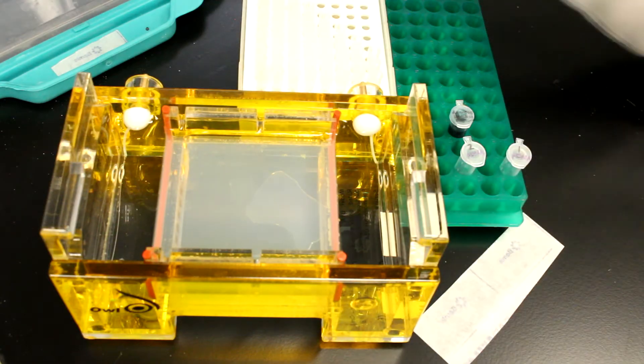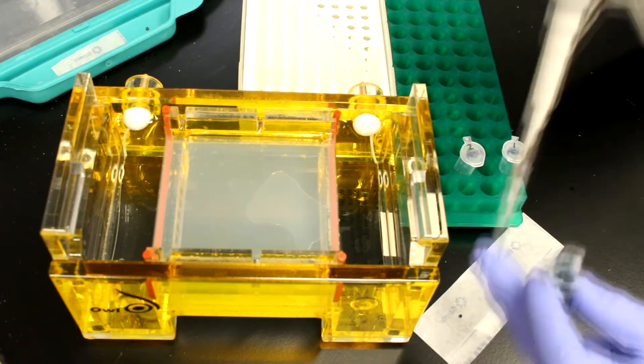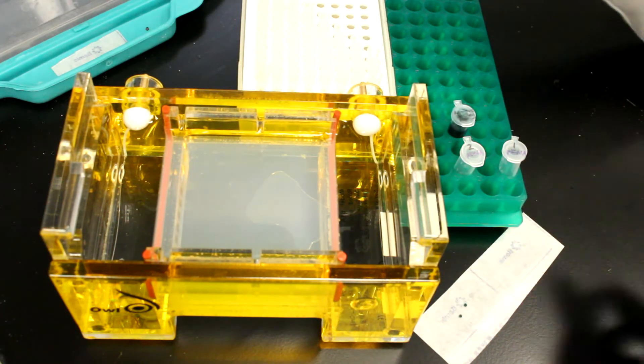To begin, two microliters of agarose loading buffer per sample is pipetted onto a piece of parafilm. In this example, we have two purified PCR products to visualize.